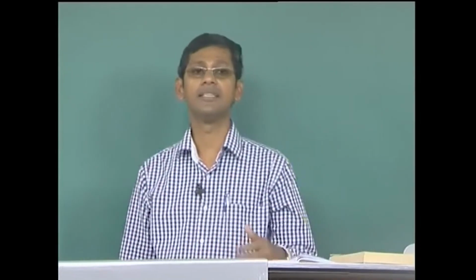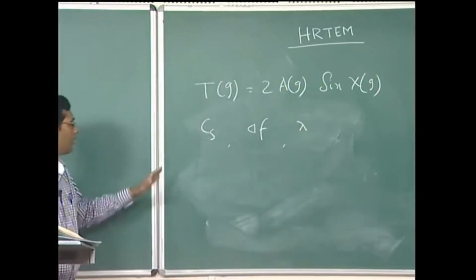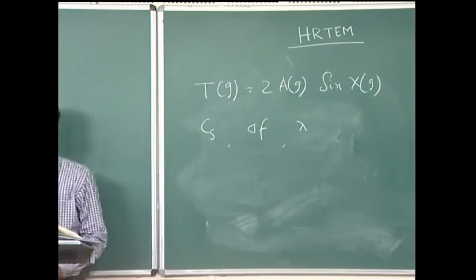delta f is the focus, which is basically the objective lens defocus, and the third factor is obviously the wavelength. We will see that Cs and wavelength are related, we will see that also.